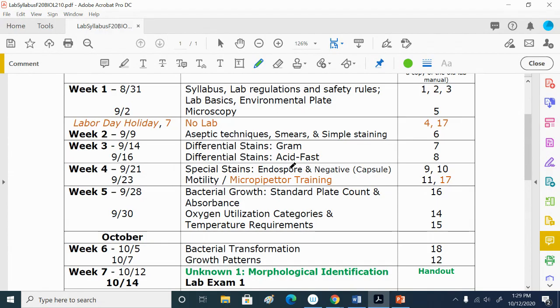Right, protection from phagocytosis, right, from the immune system. So the thick layer of polysaccharide is protective. It's also sticky. We also mentioned the nigrosin stain, a black dye, which sticks to the glass slide, but not to the bacteria. So they show up as clear cells against a black background. The main idea is that whatever you are trying to see is not stained, but everything else is, which allows you to see what is not stained.